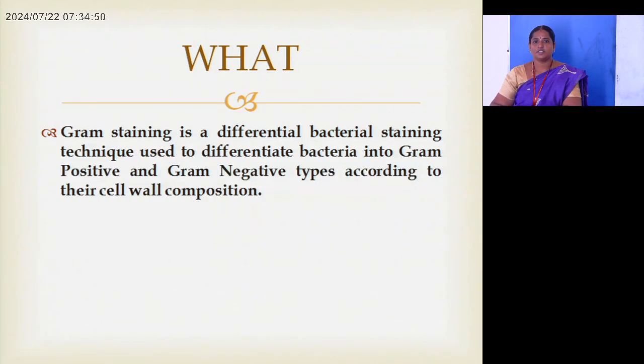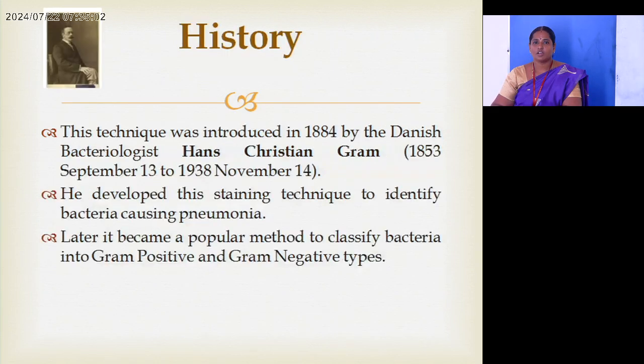First, what is gram staining? Gram staining is a differential bacterial staining. It's one of the techniques used to differentiate bacteria into gram-positive and gram-negative types according to their cell wall composition.